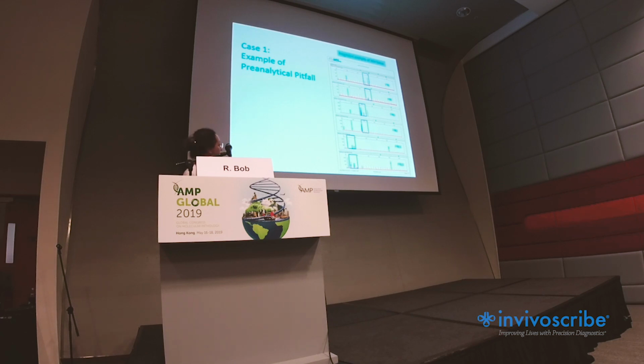You see we have non-reproducible peaks in all frameworks with fragment analysis. We applied all of the analyses in duplicate, so you see that these peaks are not reproducible. That's the reason we know they are just pseudoclonal peaks. Here as well, we have nothing. And also here for framework 3, I marked the area where we will look for the product regarding the base pair.